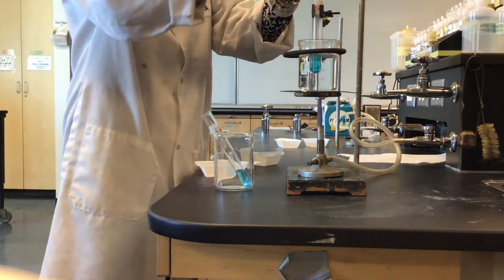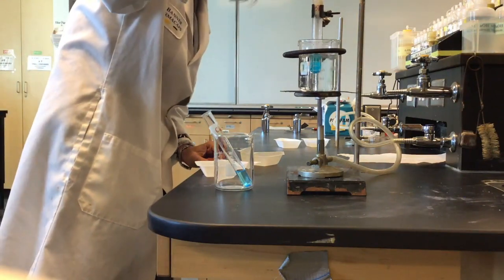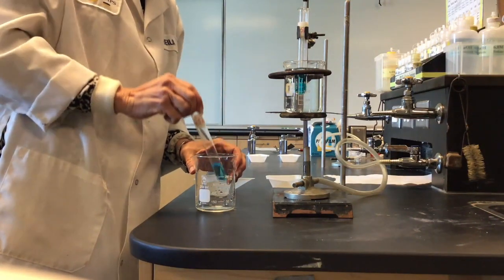This one doesn't seem to be dissolving. But the one in hot water, it just about has dissolved. With enough swirling of my room temperature sample, I eventually got it to dissolve.